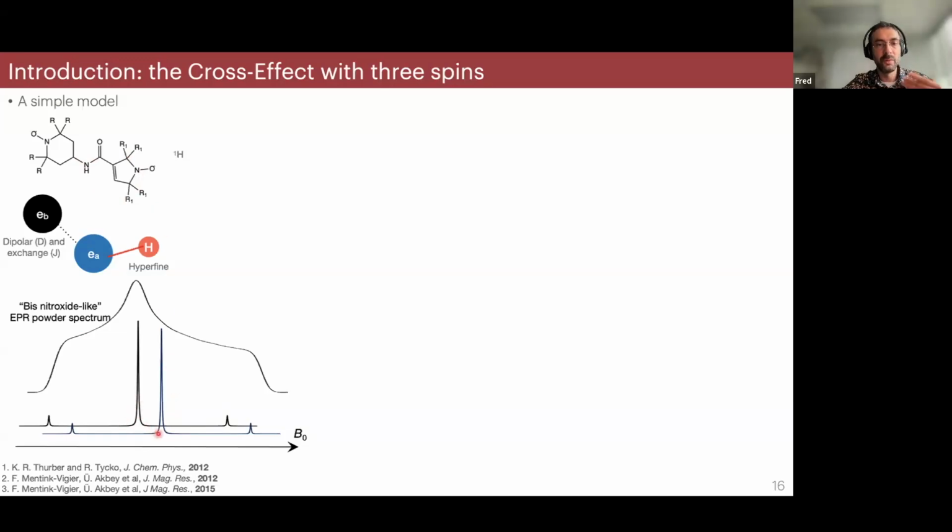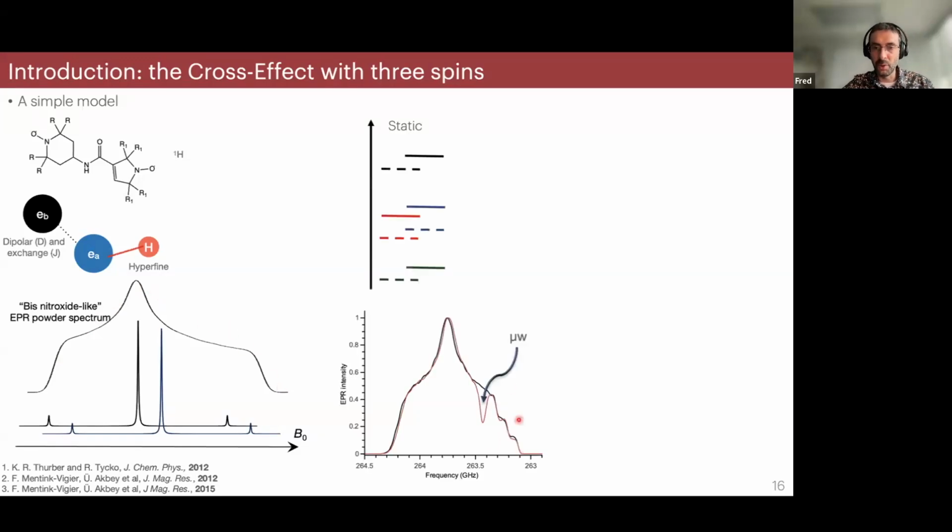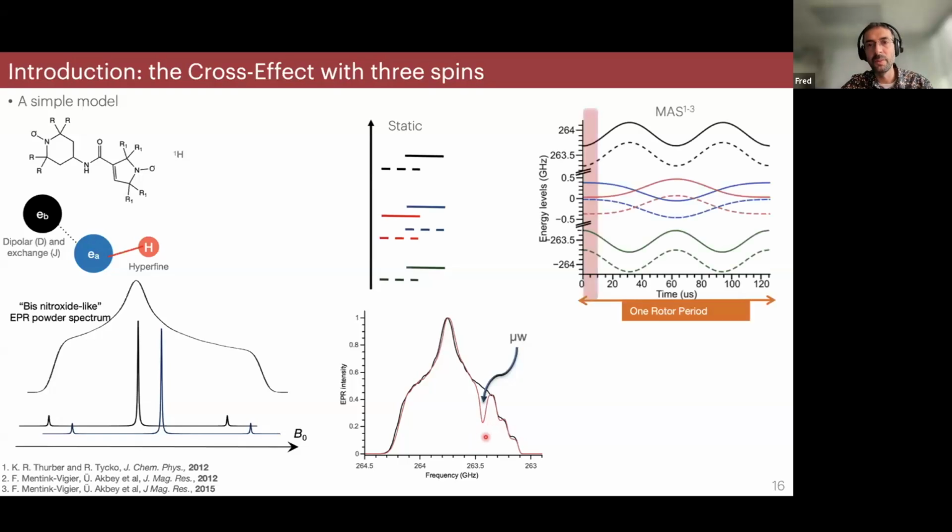If you take a single crystal of this biradical, let's say, this would give you the black and blue EPR line. So this would be for each of the radicals if you ignore the coupling. And if you take a powder, that would give this broad pattern. Under static conditions, you would burn a hole into your EPR line if you were to do the DNP experiment. It's a little more complex, but we will keep it simple. You just burn a hole.